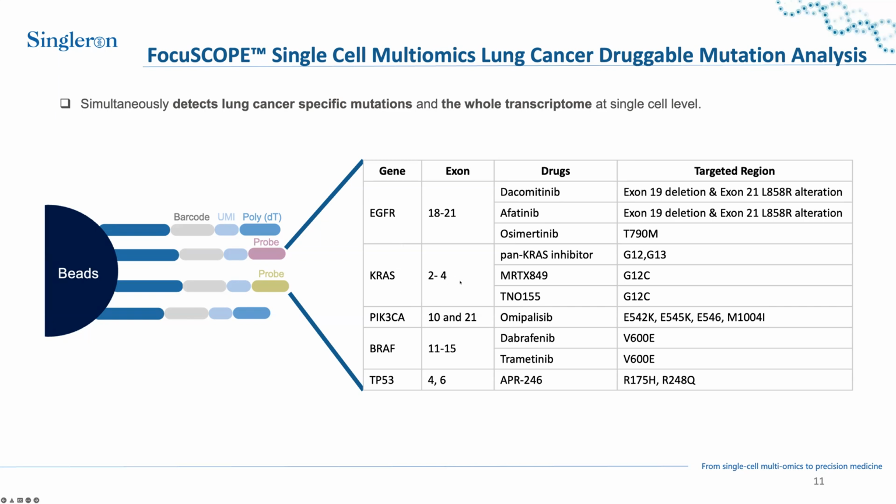And here, for example, you can see the genes EGFR and KRAS. They are both genes that are important for signaling pathways and are involved in triggering cell proliferation.